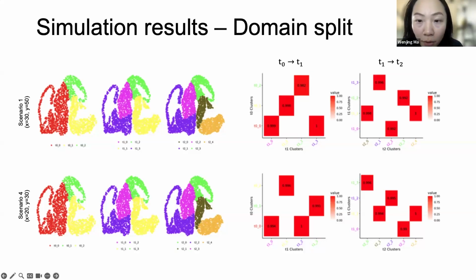Does that mean you are mapping all clusters from? Yes. As I mentioned, the number of clusters is pre-given to the tool if we do the analysis. But if we are not doing the analysis and we do not know the number of clusters, what I did was, from the embeddings, I perform k-means clustering with k equal to 10 or 20 so that we can also capture all the clusters from the domain.